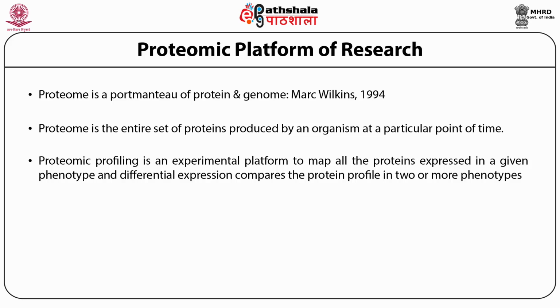This also encapsulates the fact that researchers across the world are analyzing subproteomes by selecting a set of cells and particular conditions. This is done in order to understand the more complex picture of proteomics and the dynamics involved.